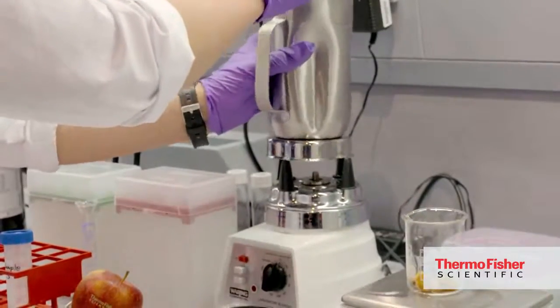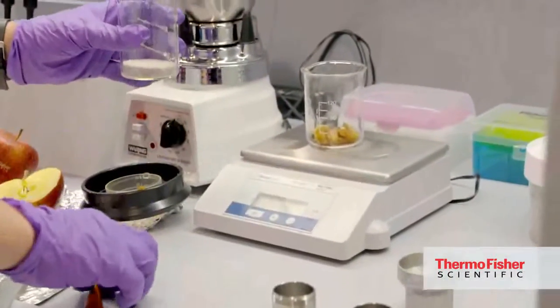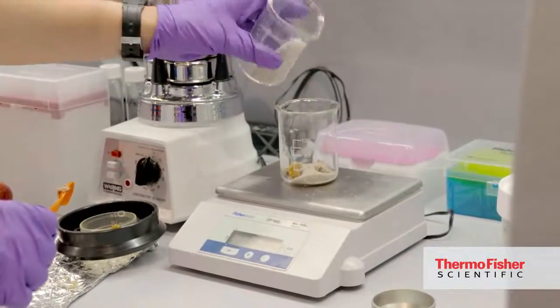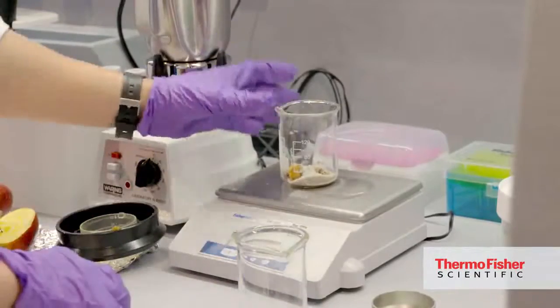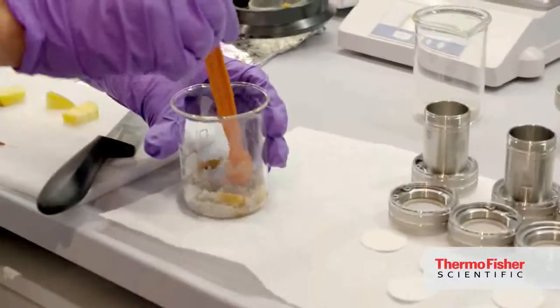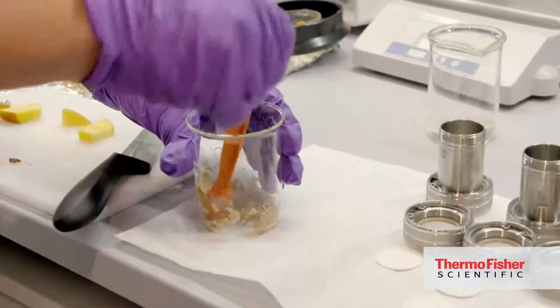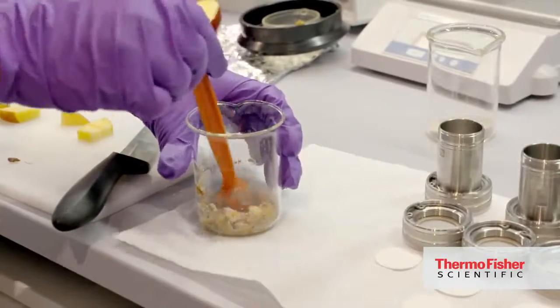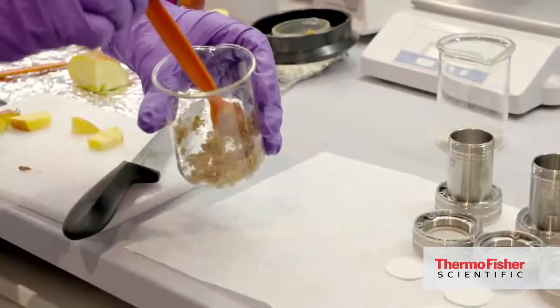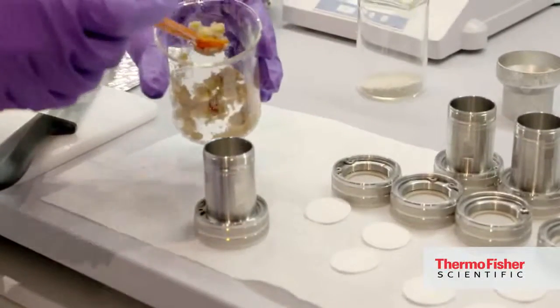And for the accelerated solvent extraction, we need dispersant. This has to be added right now in a ratio of more or less 4 sample units to 1 dispersant unit. This is what was done. This has to be carefully mixed so that it's more or less homogeneous. And whenever it is, then it is simply put into the extraction cells.